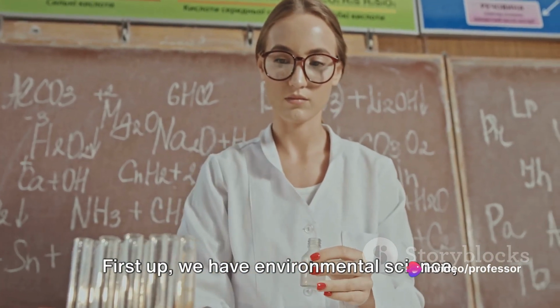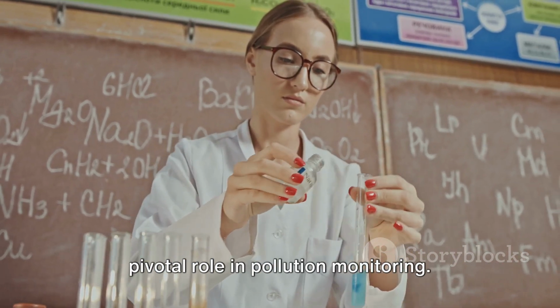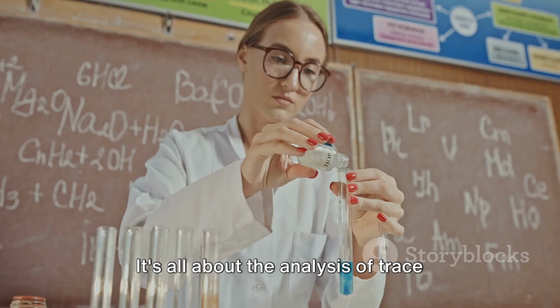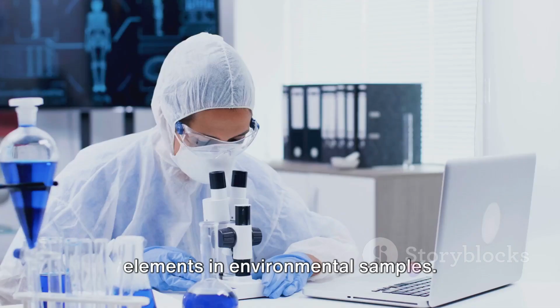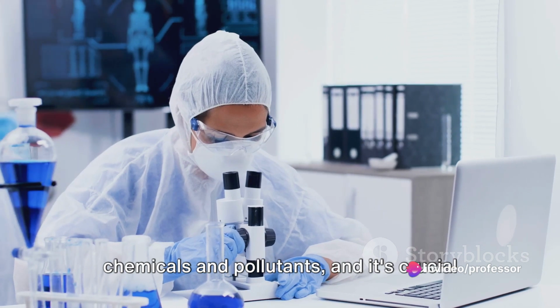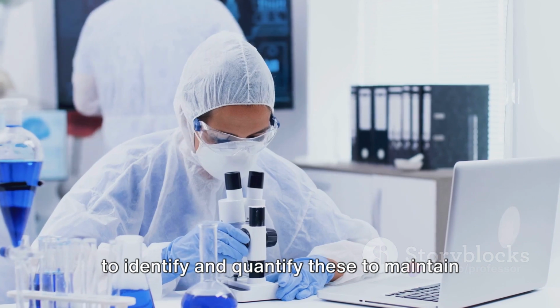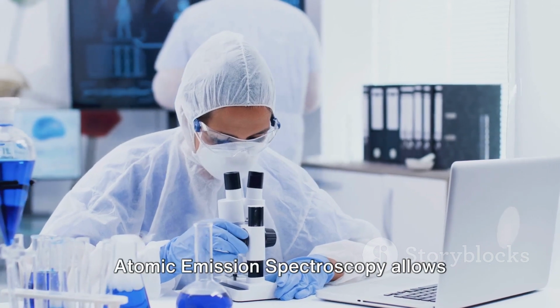First up, we have environmental science, where atomic emission spectroscopy plays a pivotal role in pollution monitoring. It's all about the analysis of trace elements in environmental samples. Think about it, our environment is constantly bombarded with various chemicals and pollutants, and it's crucial to identify and quantify these to maintain the health of our ecosystem.